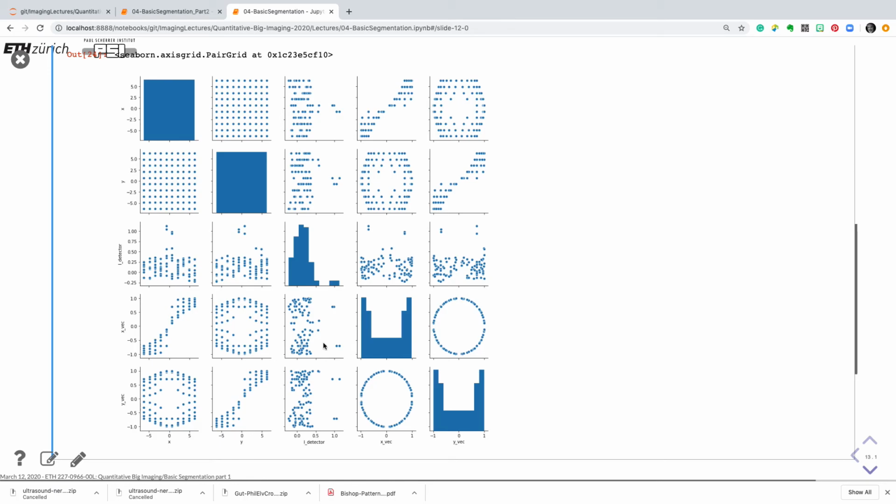And looking at a histogram between the different features in this array, you have X and Y position. So X and Y, they are uniformly distributed across the data. If you see them together, you see a distribution like this. And then we have the intensity relative to position in X and Y. And here you have the histogram of the data. So it's a way to illustrate the whole feature set.